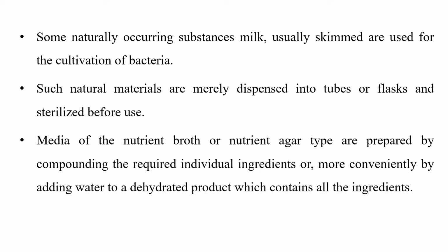So media, either in the form of nutrient broth or nutrient agar, should be designed and prepared so that they have all the nutrients required for the growth of the organism. Nowadays, commercially available dehydrated products are available.